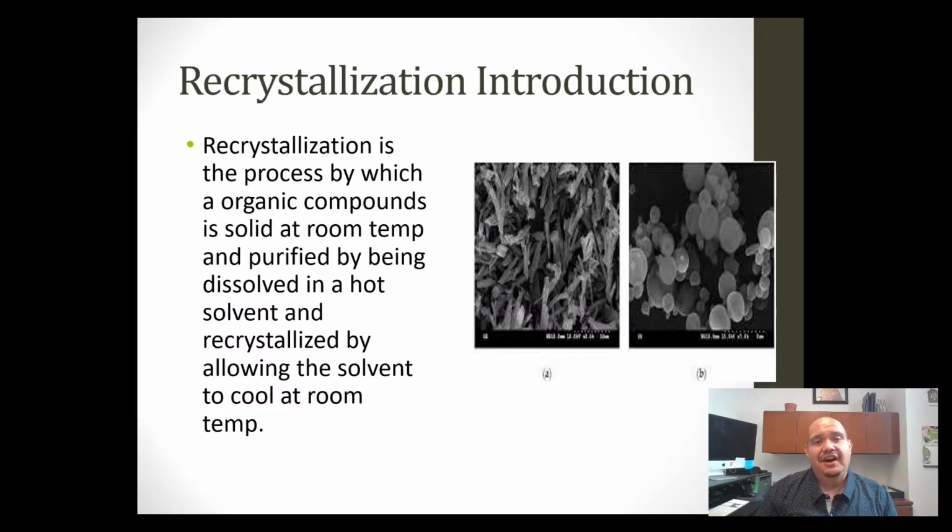Recrystallization is not an organic synthesis reaction, meaning what you start with, the original solute, should be the exact same thing that you end up with at the end. The only difference is that the impurities, or the dirty stuff inside the crystal, should be removed, and therefore your crystal will go from dirty to pure, or in scientific terms, crude to pure. So the whole idea and objective is that recrystallization is a purification technique.